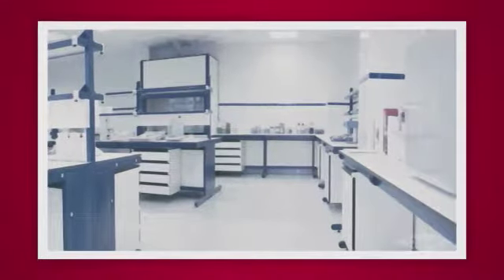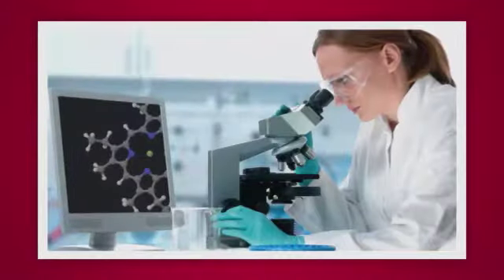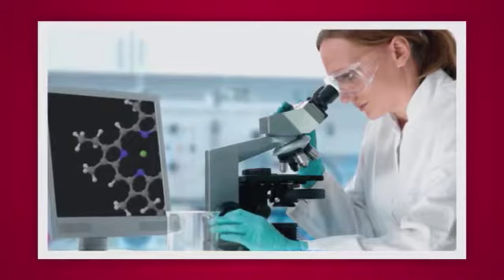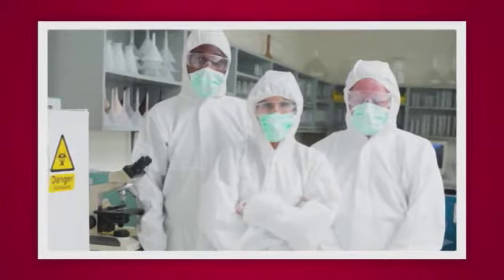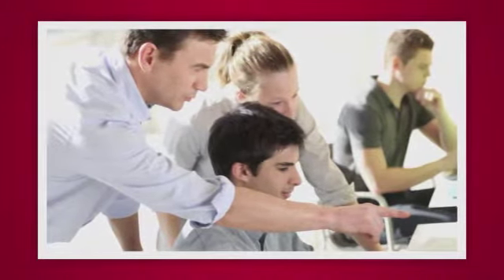Match your reviewers with the type of change that you're planning. For instance, if you are installing new equipment, get people who are familiar with that type of equipment. If you're using new chemistries, get people who are knowledgeable about those. Use their knowledge to your advantage. And don't forget, your EH&S experts can help detail proper personal protective equipment or PPE needed, waste disposal techniques, and emergency response. An added bonus to the review is this type of cross-functional involvement creates networking opportunities. You will get to know people throughout your department and in other functions as well, and they will get to know you and your commitment to safety.